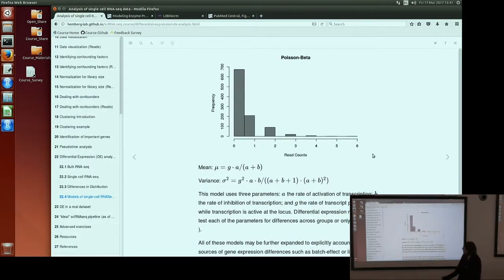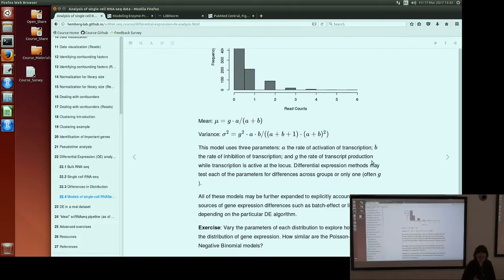Again, you can calculate the mean and variance for the distribution, although calculating the specific distribution is not analytically tractable. So it's generally much harder to fit this kind of model to your data than the negative binomial or zero-inflated negative binomial. But it has the benefit of being interpretable, and there's a lot of evidence from actual experiments showing that transcription should follow this kind of distribution.